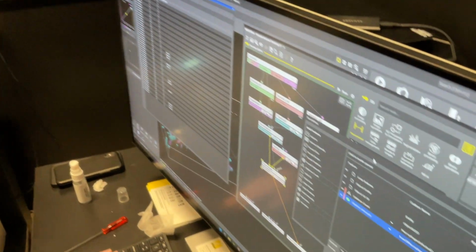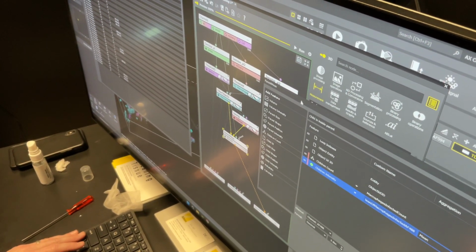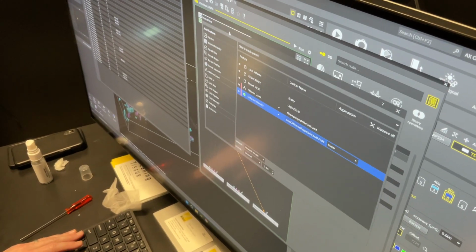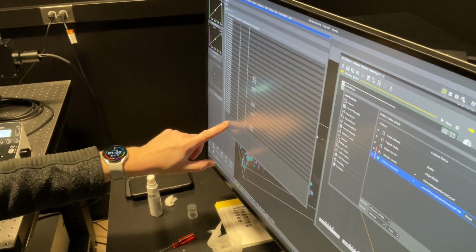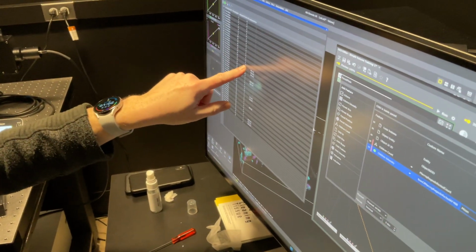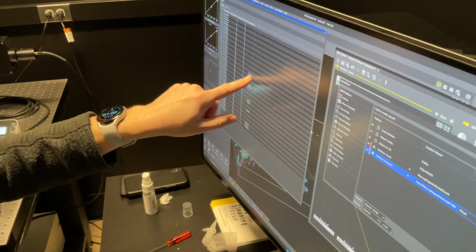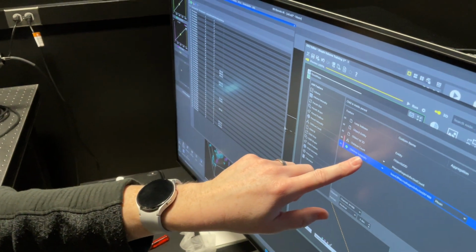So basically what I did here, and we could actually change this, if you just care about the far red, I care about the far red at the end of the day. What the parent-child relationship has done is it's counted all of the macrophages, and then it counts the children of the macrophages, which in this case is the infected layer, and then I can measure specifically the intensity of the children in GFP.